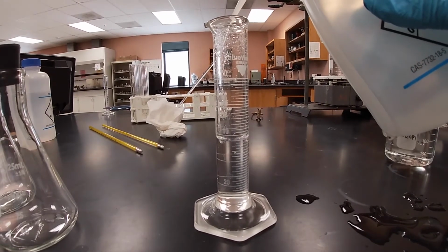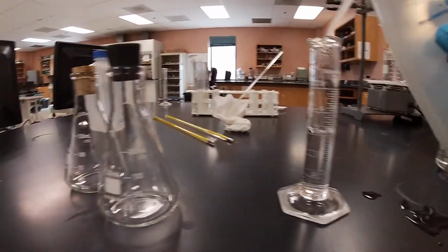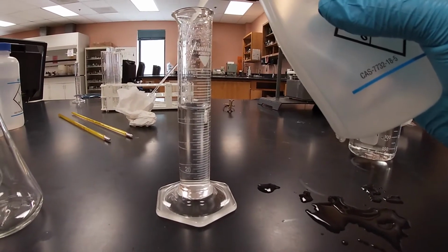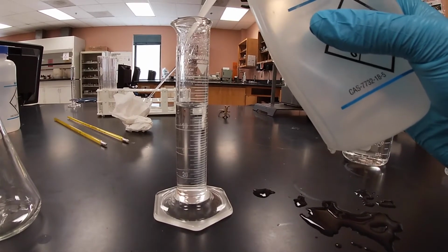As I measure the 50 milliliters, we're going to transfer it onto our Erlenmeyer flask, and then add a drop of soap and try to create a suds layer, and that'll be our reference.